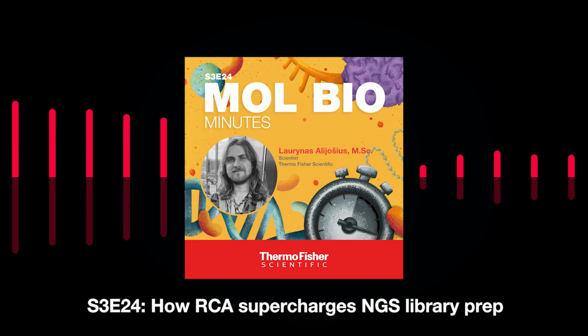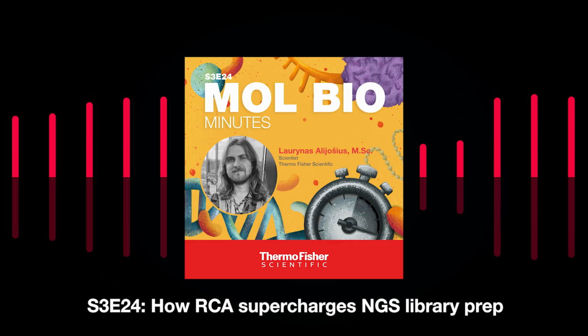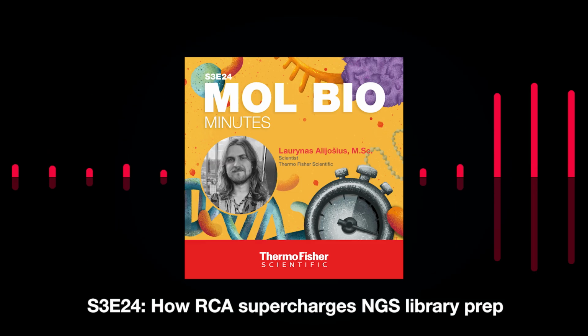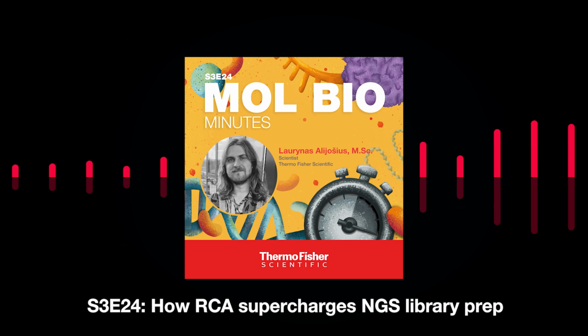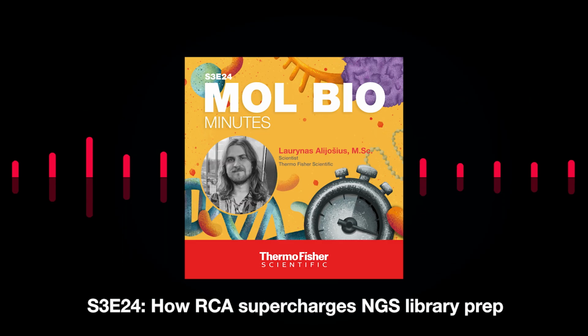And using specific primers may help you down the road. It may help to improve the number of NGS reads for your specific target of interest. There can be multiple strategies to apply this. You can perform RCA only with a specific primer, or you can try to mix the specific primer together with random primers, or you can even use a set of specific primers. So, as you can see, there are many ways to experiment here to get the best results that you seek.